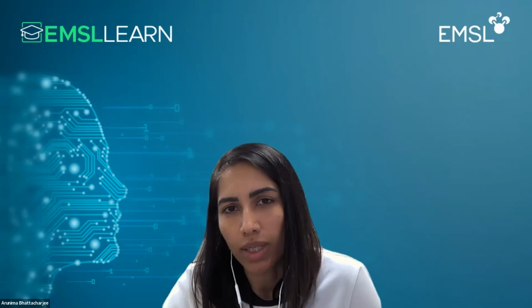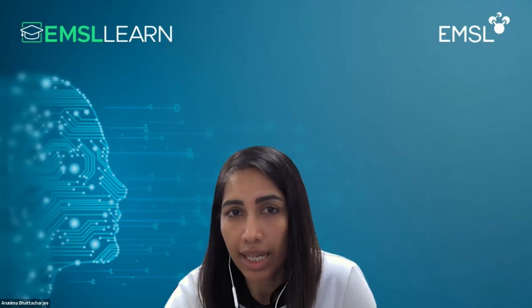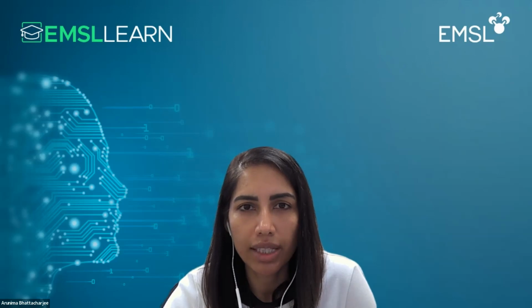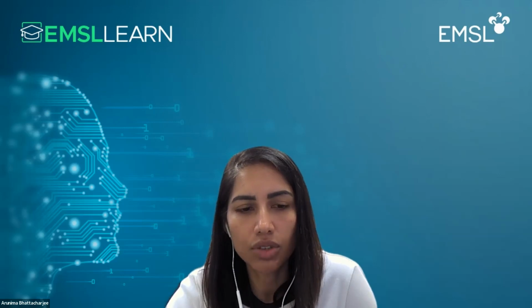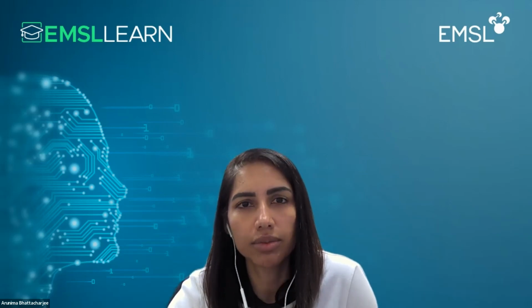Nishant Paniker has a question. Is the plant microbe interaction analysis from MS1, is the QC decoder workflow publicly available? So the data that I showed here, yes, it is MS1, but we do have MS2 data, and we can get MS2 data from these analyses. The QC decoder workflow is not publicly available yet, although for this particular analysis, we might make it publicly available. We are trying to make a more organized workflow for all of the wells that we have in the SubTap, so that users can just upload their data, and there's a more automatic workflow available for the users as well.